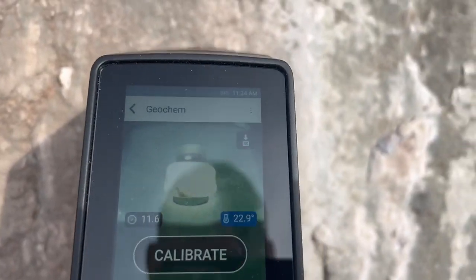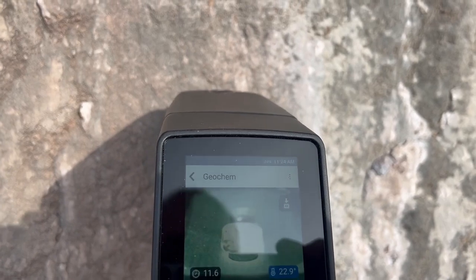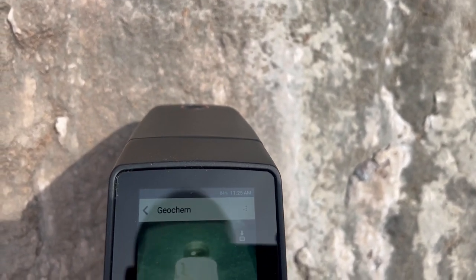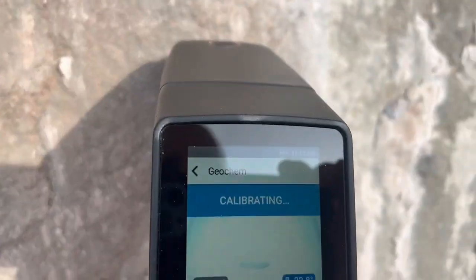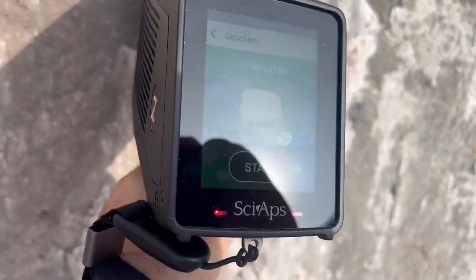I wanted you to see the screen. I'm going to bypass that and the next thing it's looking for is a calibration shot. The way the calibration works is exactly how the device in the field works, except it's going to rotate the aperture and shoot a test internally — measure that wavelength and check it against its own internal database to see where it's supposed to be, so it can tell if it's off.